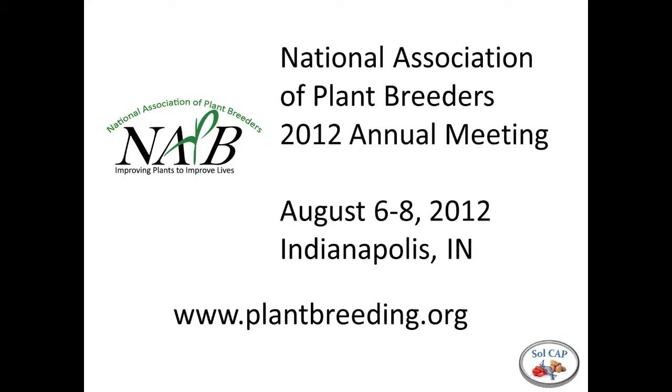Great. The next question is asking about what types of markers this is suitable for. Can you use something like microsatellites? These programs are good for any type of markers. Basically, if you put them in A's and B's, relative to the parent genotypes, that's all it requires. So whether that's a microsatellite, a SNP, an RFLP, anything you like, as long as it looks like the input file, you're ready to go.